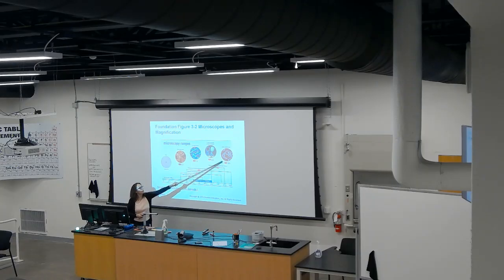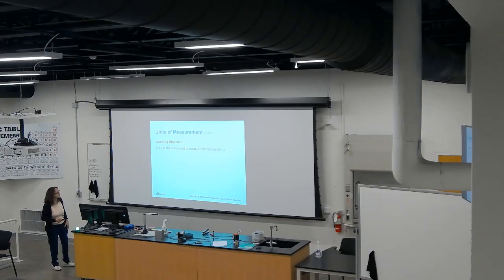And then this is double helix DNA as seen with an atomic force microscope, and typically the thickness of this DNA when it's starting to supercoil is 10 nanometers, when the molecule is not relaxed.